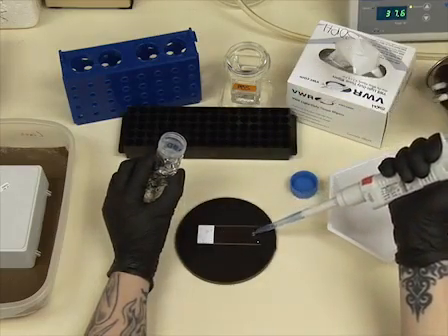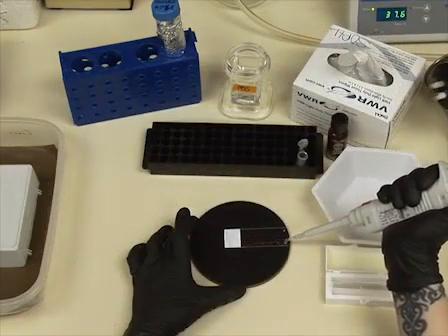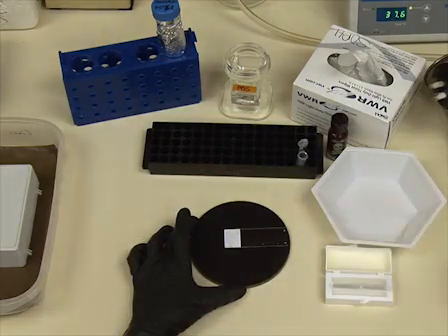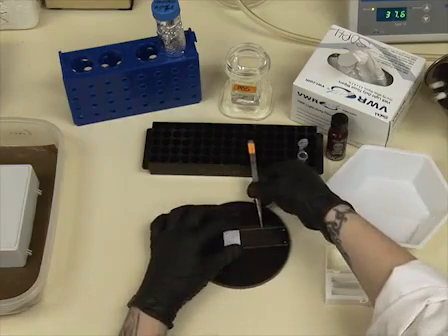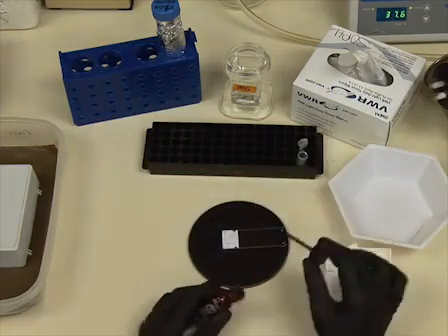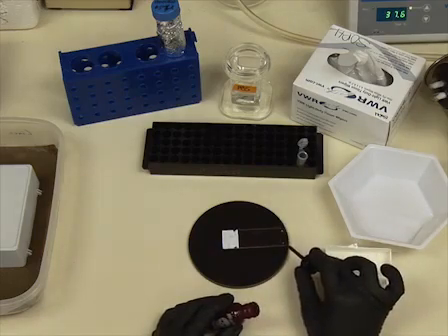Once all washes are complete, apply a generous amount of mounting medium to the bottom of the slide and cover with a glass cover slip. Secure the corners with nail polish. Once all slides are cover slipped, secure the rest of the cover slip edges. Image the slide right away or store them at -20 until you are ready to do so.